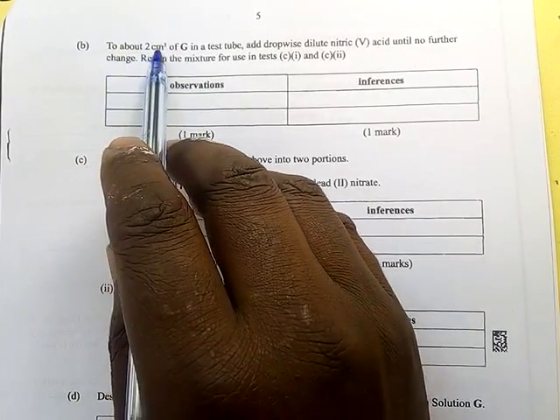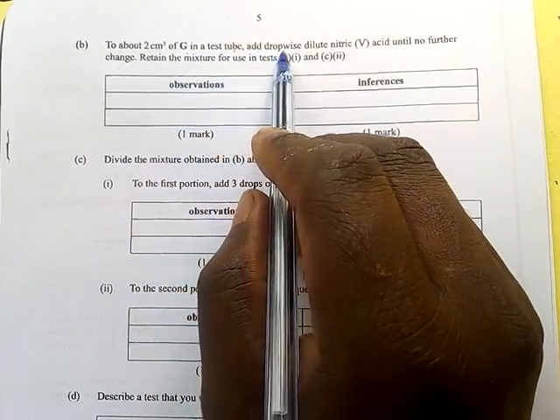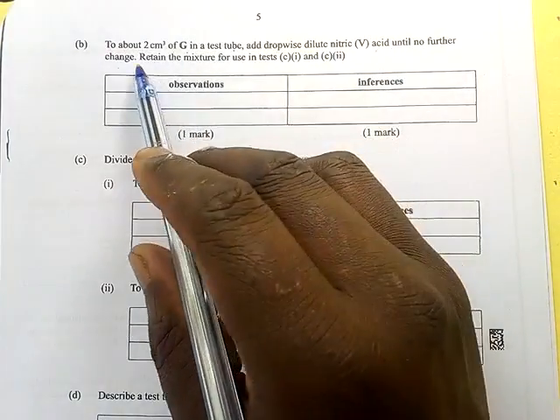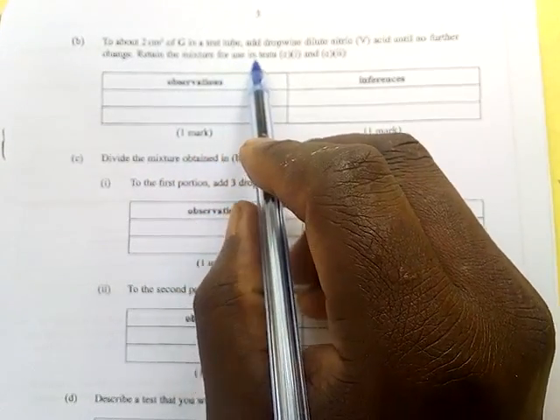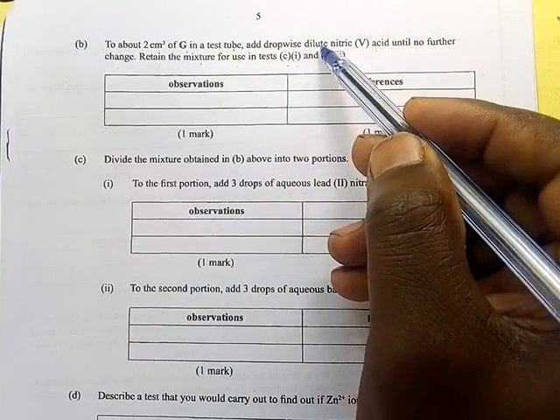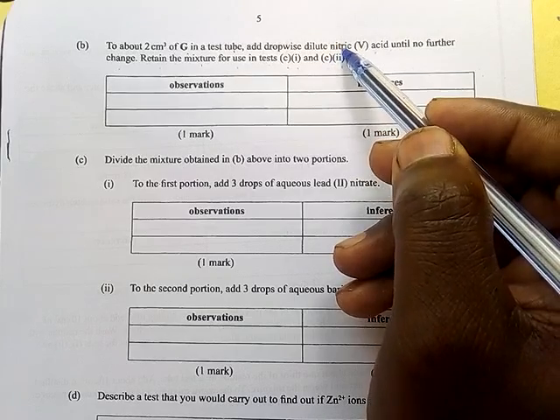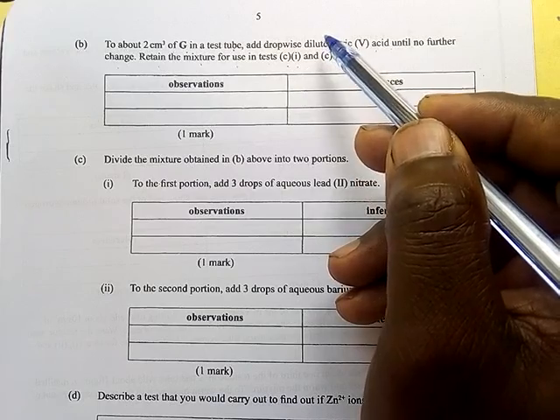To about 2 centimeters cube of G in a test tube, add dropwise dilute nitric acid until no further change. Retain the mixture for use in test C Roman 1 to C Roman 2. So whenever you are adding any acid, whether it is nitric acid or hydrochloric acid, into a solution in a test tube, the first observation you are expecting is effervescence.